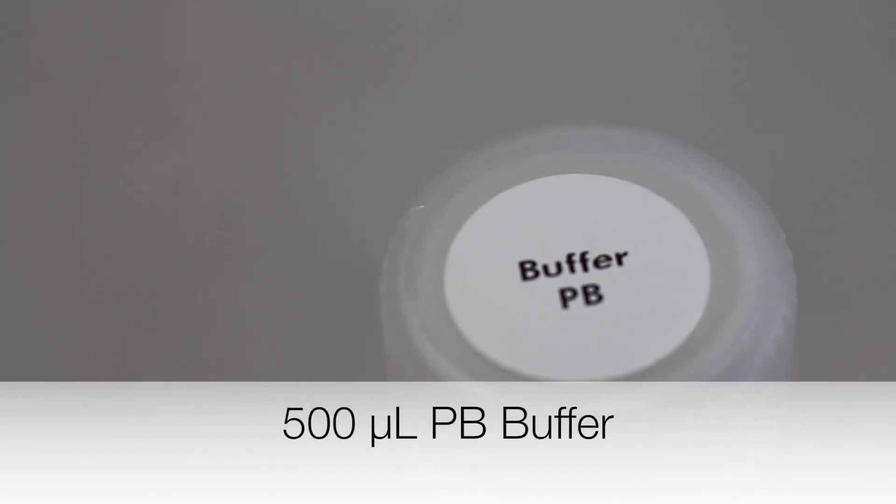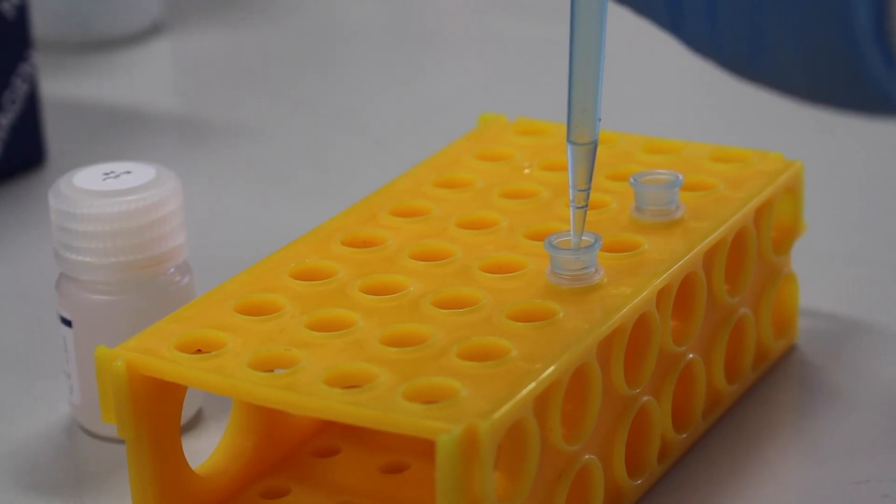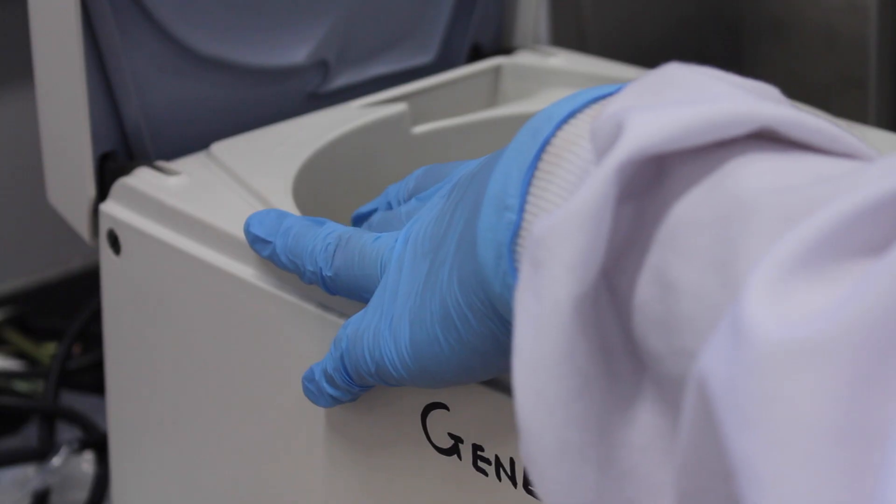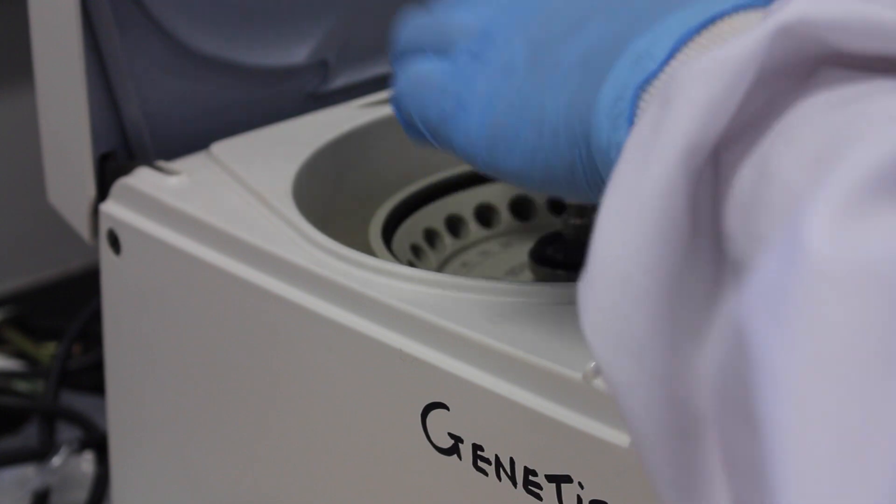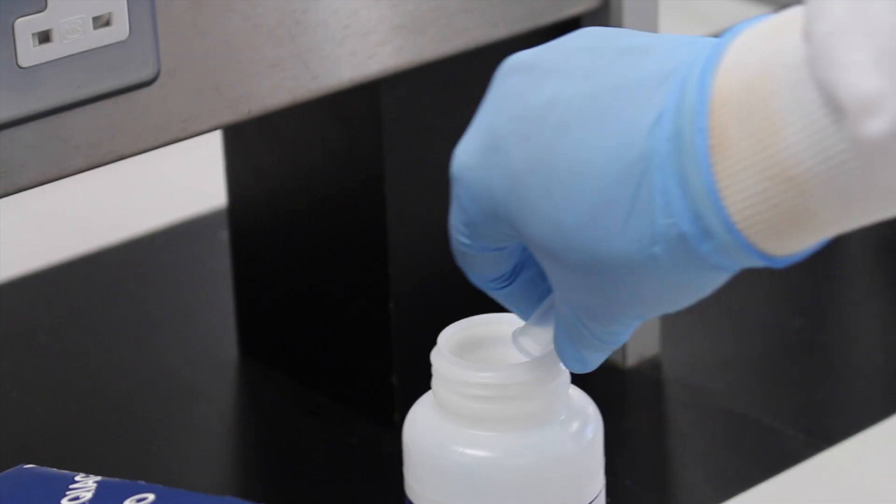500 microliters of buffer PB is then pipetted into the spin column. This step is necessary to remove trace nuclease activity when using endonuclease A positive strains and is not required for strains such as XL1-Blue and DH5 alpha. The columns are centrifuged at top speed for 1 minute. The flow through is discarded.